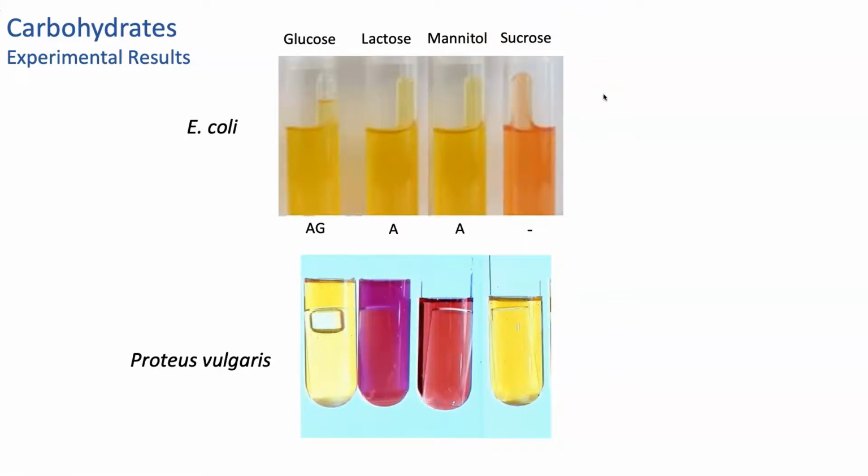That means that sometimes some strains of E. coli are positive for sucrose fermentation and sometimes they're negative. So that's what V means. And some of you will have some of that as your experimental results. That can be a little frustrating, but results are results.